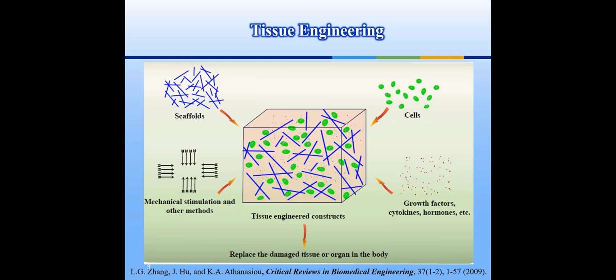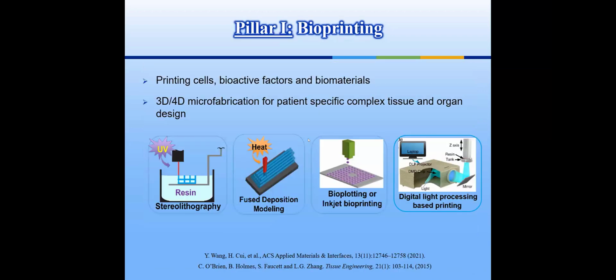Okay? So right now in my lab, we consider we have two key pillars. The first one is related to bioprinting, like printing the cells, bioactive factors, and biomaterials into patient-specific, very complex tissue organ constructs.